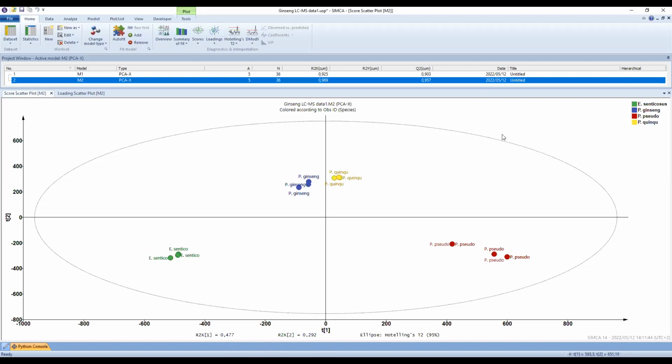Outliers essentially point to a difference or a variation in the profile, which could be something that went wrong with your extraction, or you contaminated your sample, or you got a different sample from what you were actually intending to. So outliers, you don't just remove them from the data set, you have to investigate them.